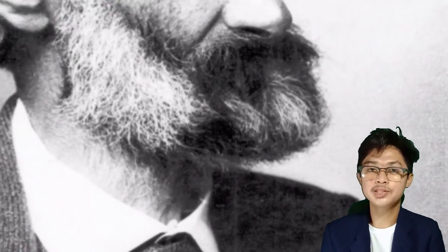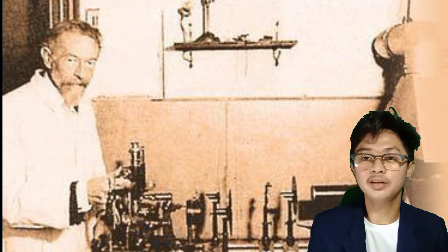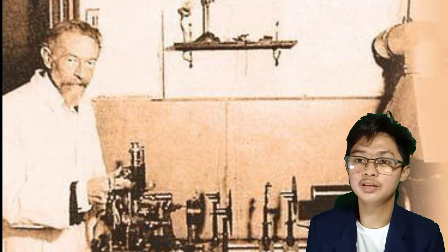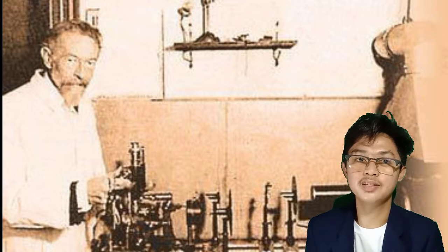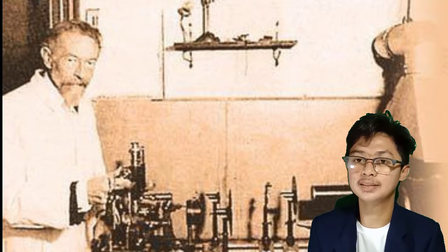After 48 years, Ernst Abbe postulated a mathematical theory linking resolution to light wavelength. In the 1900s, specifically in 1903, Richard Zsigmondy invented the ultramicroscope, which allows for observation of specimens below the wavelength of light.